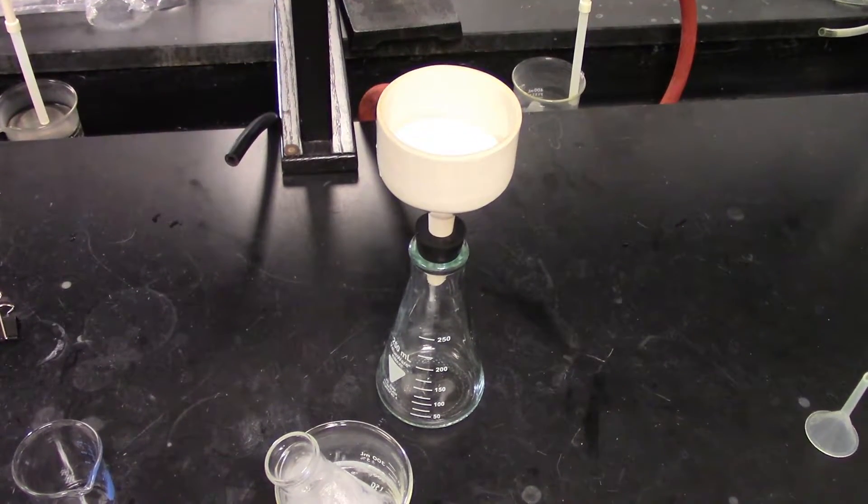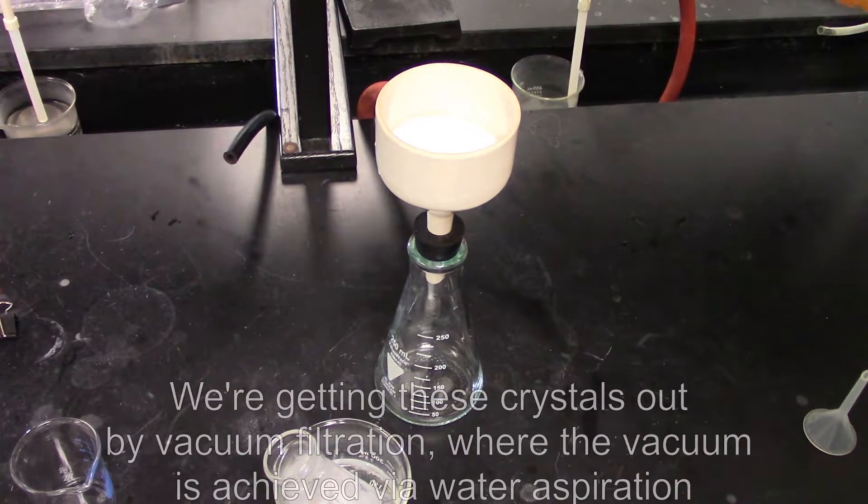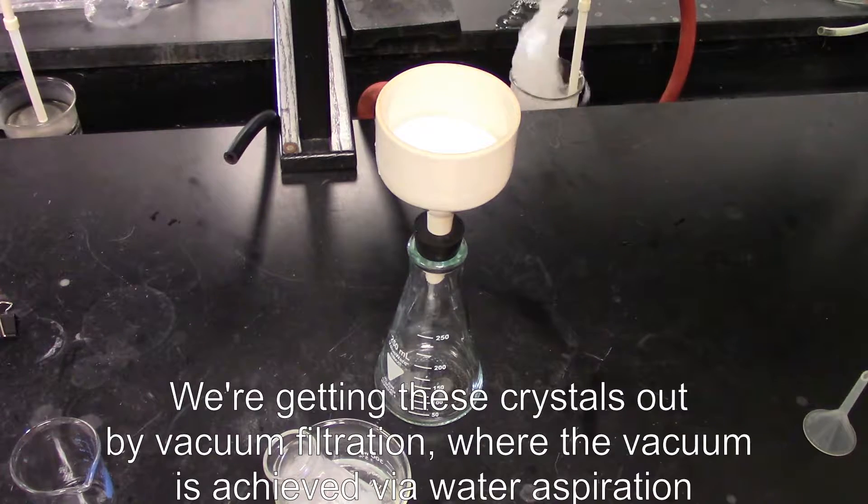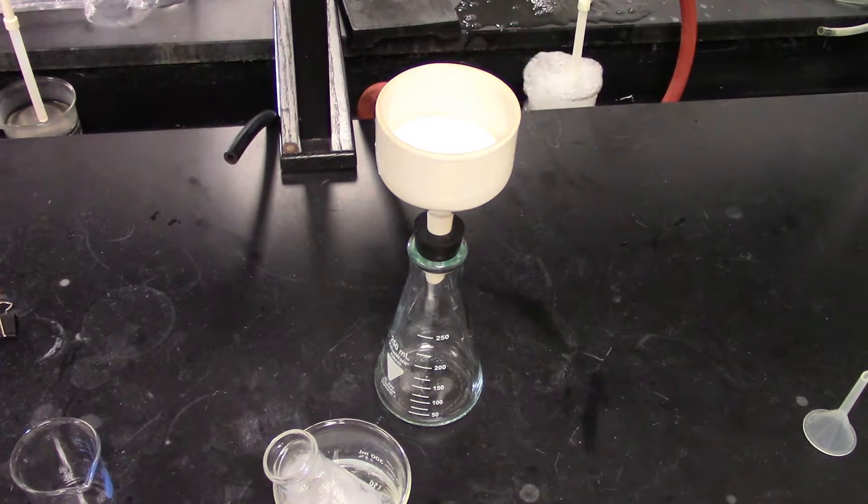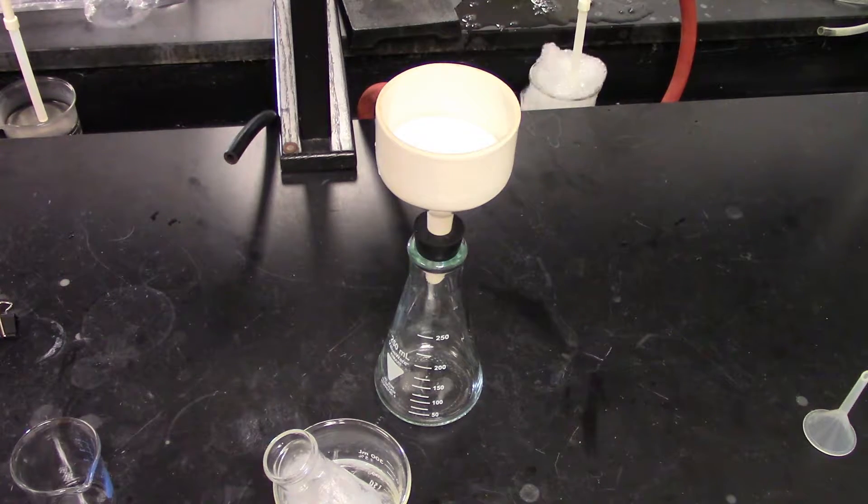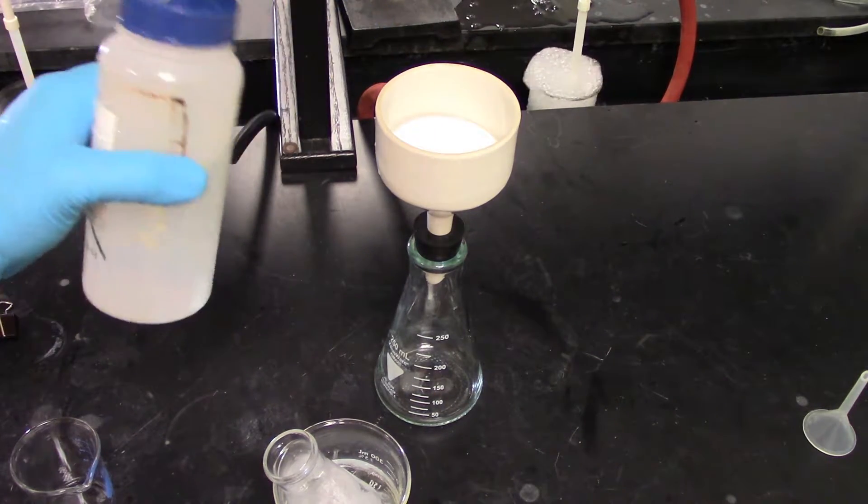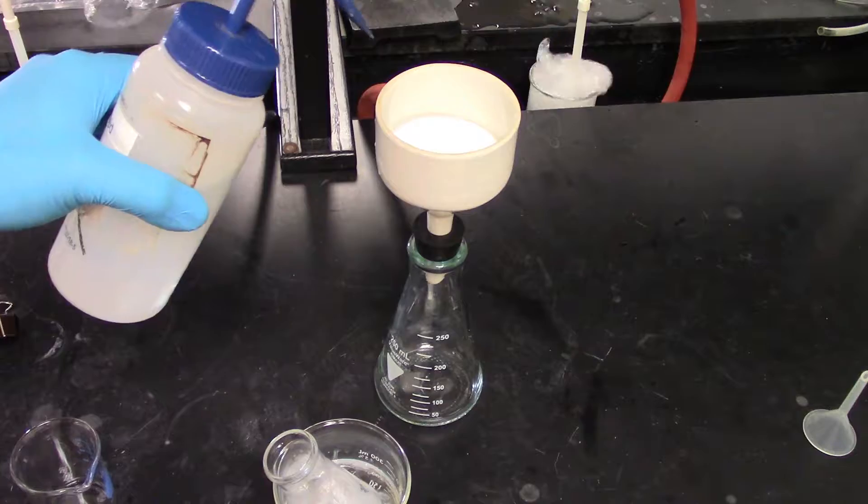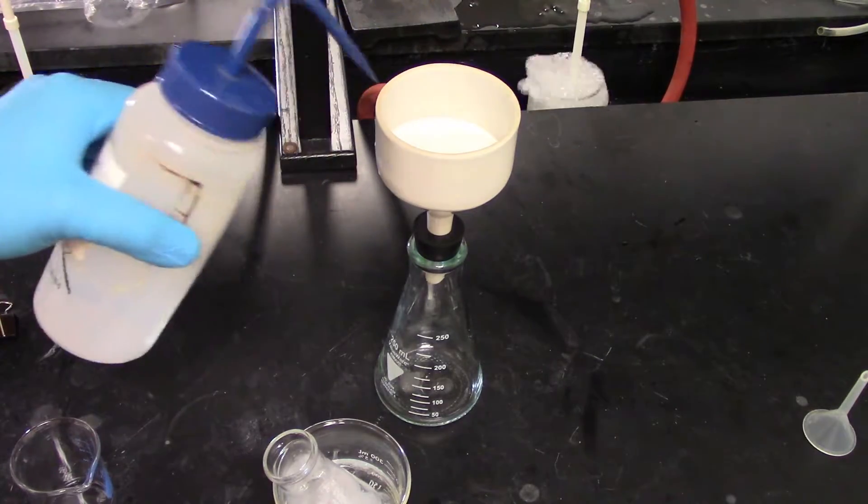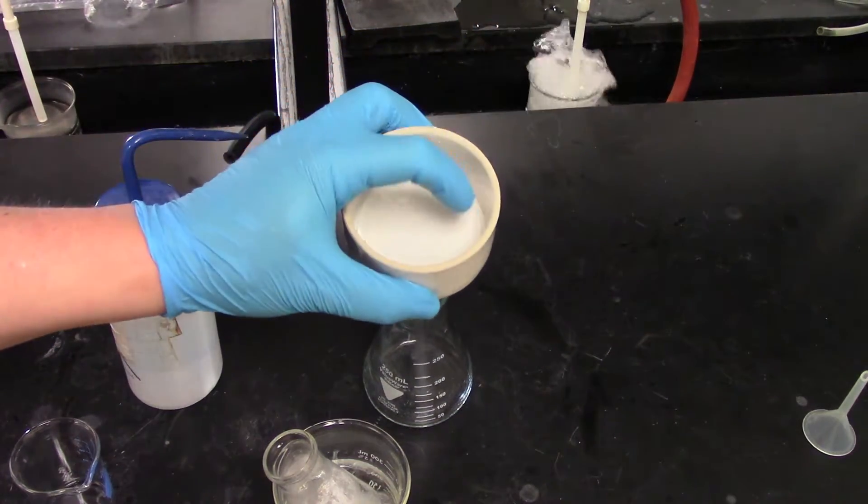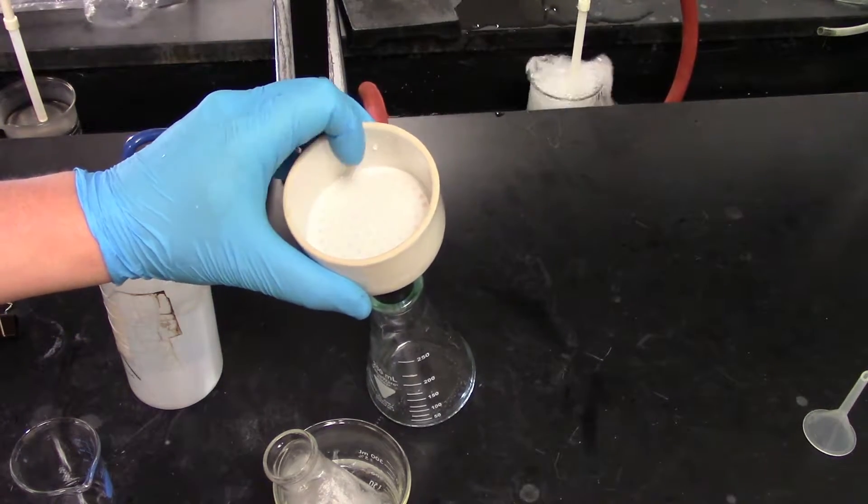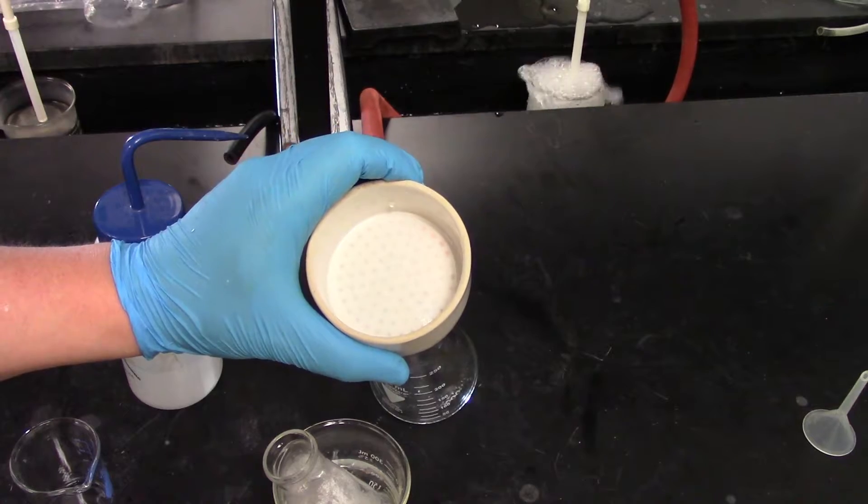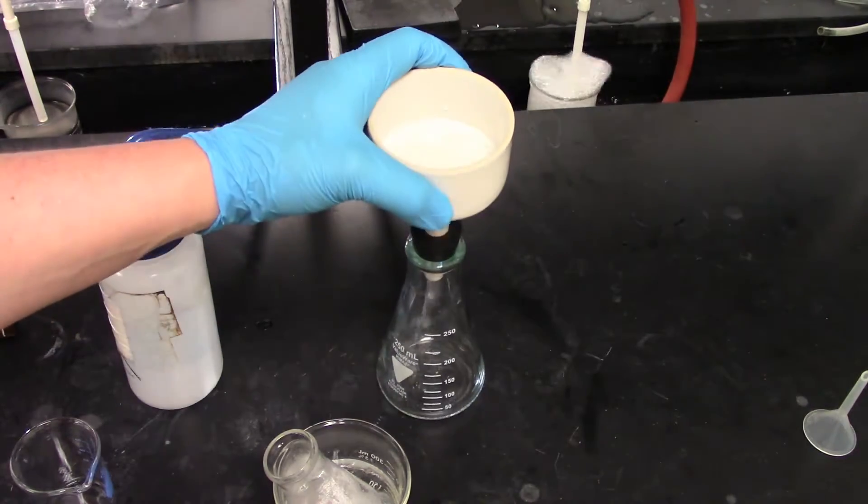What we're going to use in this case is water aspiration. It uses high water flow rates in order to create a cheap vacuum. For this I've got a pre-weighed piece of filter paper. I put it into the Buchner funnel, I'm going to get it nice and wet until it forms a seal. You can see now we're starting to draw the water through.